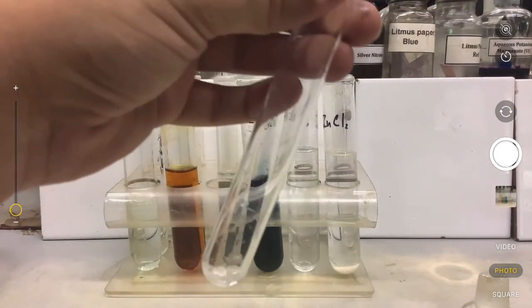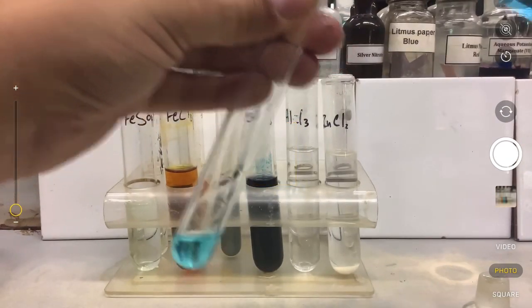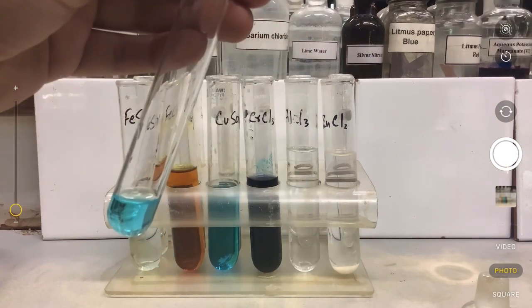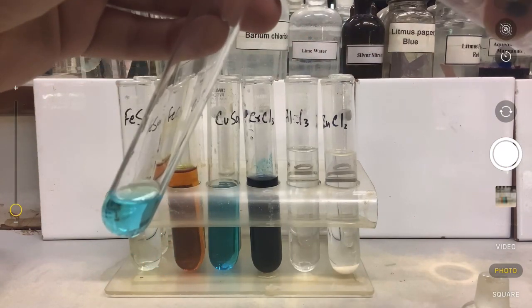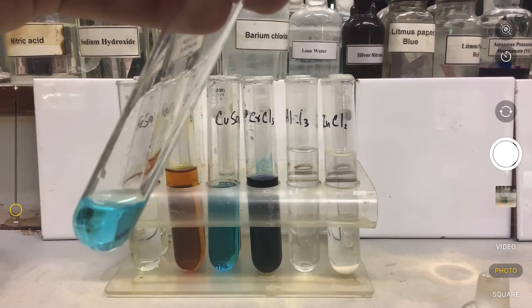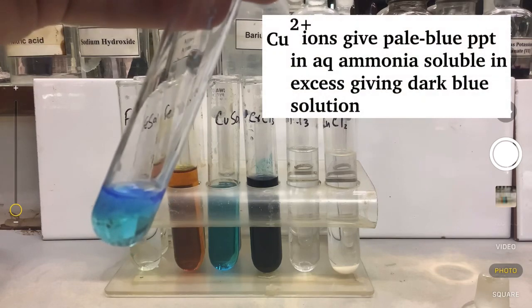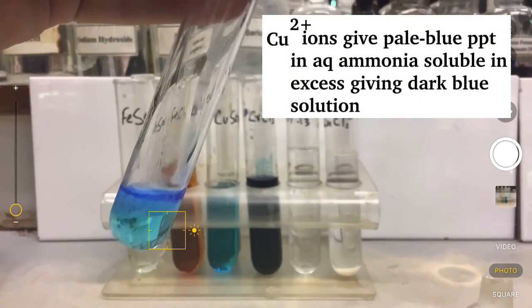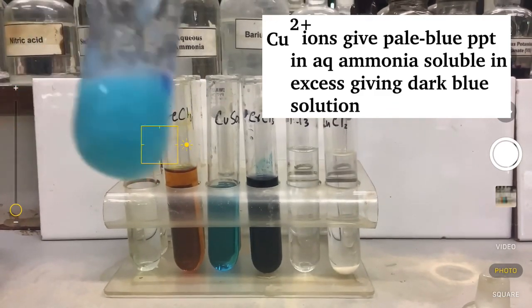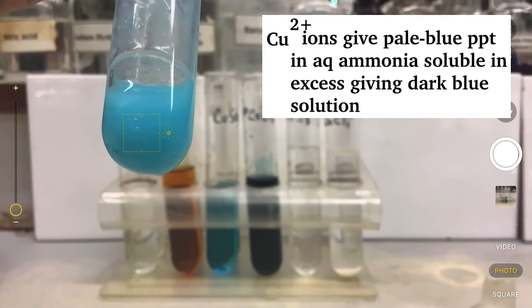When I take copper 2 sulfate, a small amount of sample in a clear dry test tube, and I add aqueous ammonia drop by drop until a change is seen, I will be able to see this time very clearly pale blue precipitates, as you can see in this video. These pale blue precipitates are made because copper 2 ions made their copper 2 hydroxide.